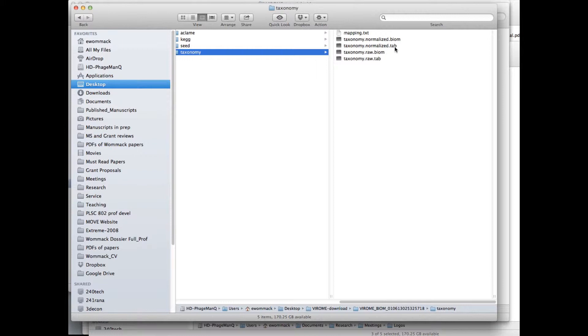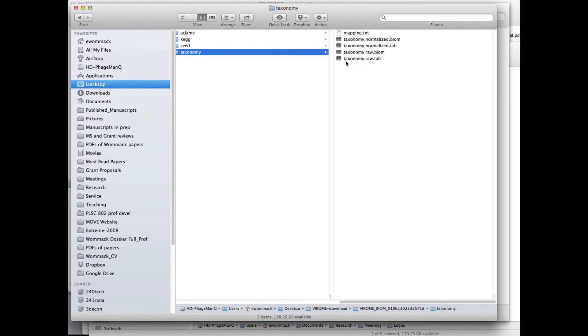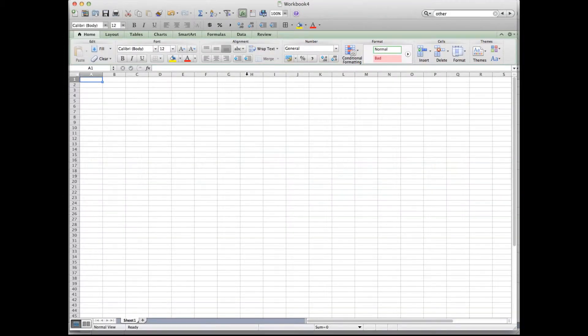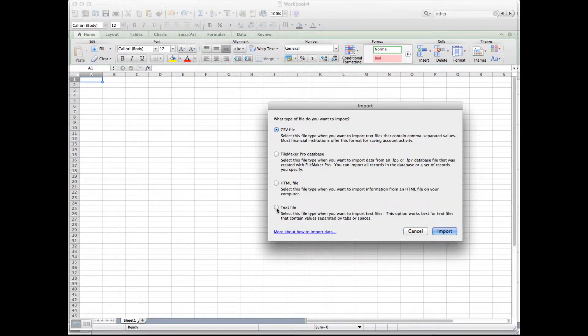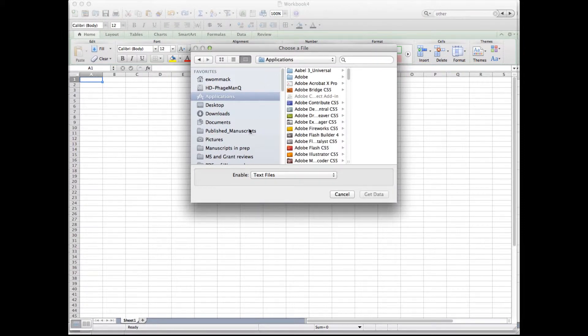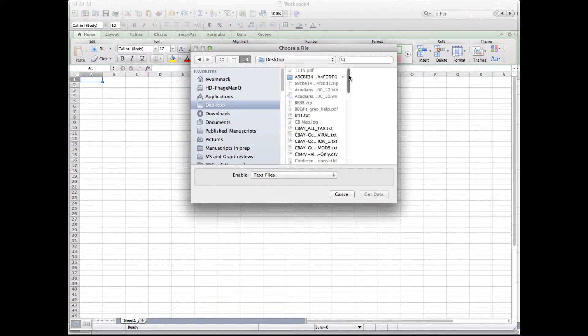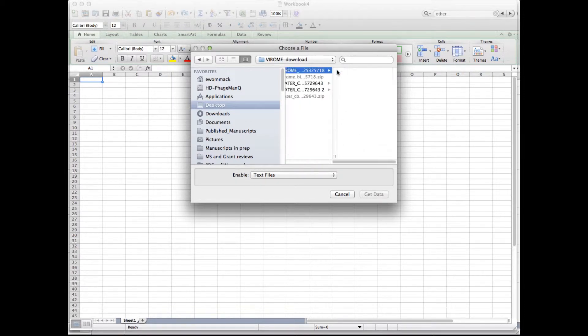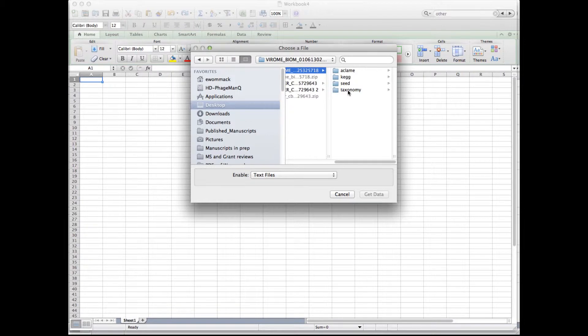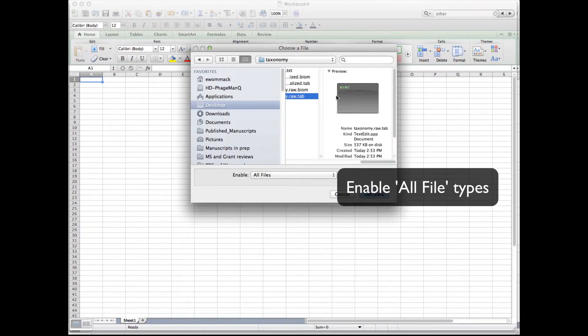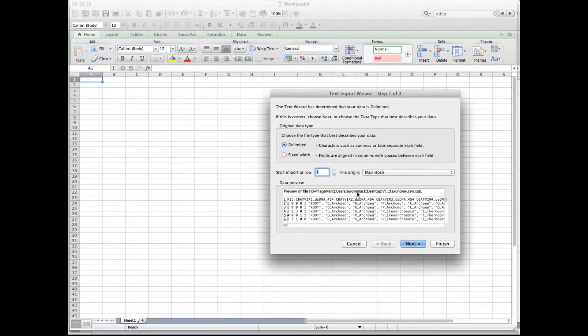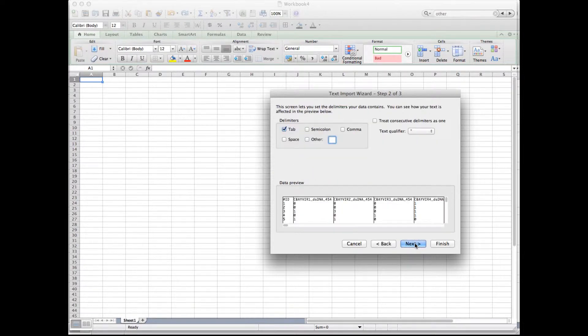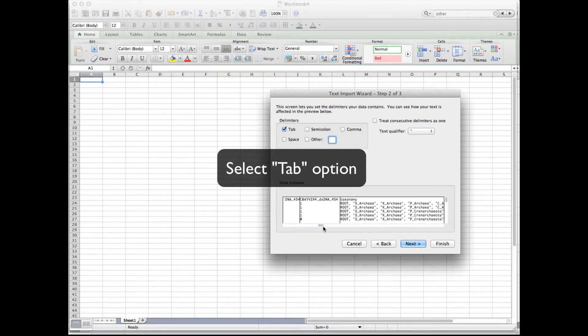It's possible to open the tab-delimited files in Excel. So here I show the taxonomy file and then my four files and the mapping file. I can navigate to Excel, then I can import as a text file because this will be tab-delimited. Navigate to the folder, I have to set for all files. And then I download this raw tab file, so I click get data. And then I simply go through the dialog box with tab-delimited, select it.